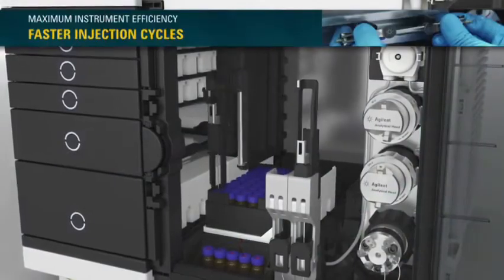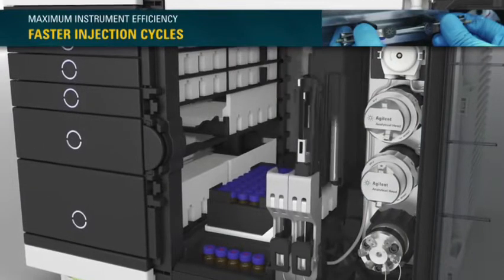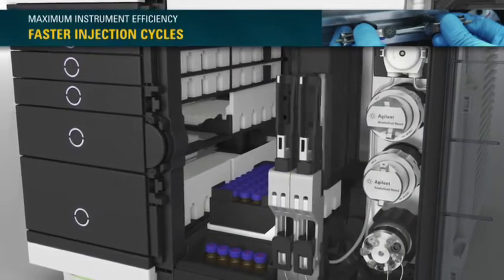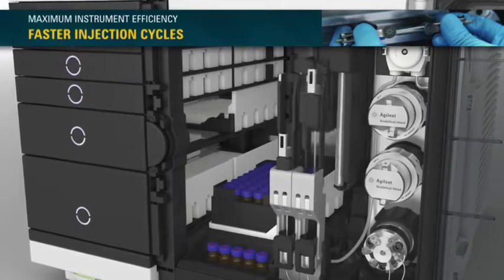By running samples alternately, the dual-needle injection mode reduces cycle times to mere seconds, virtually eliminating sample injection time.